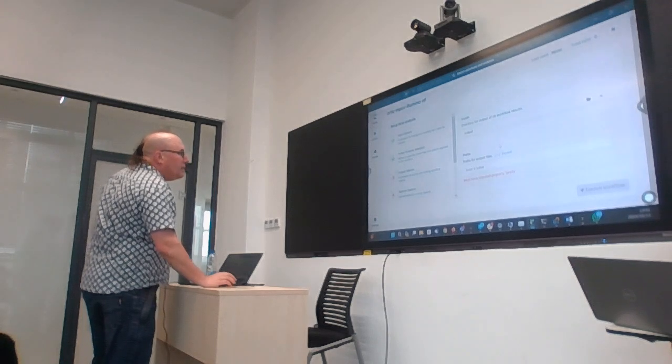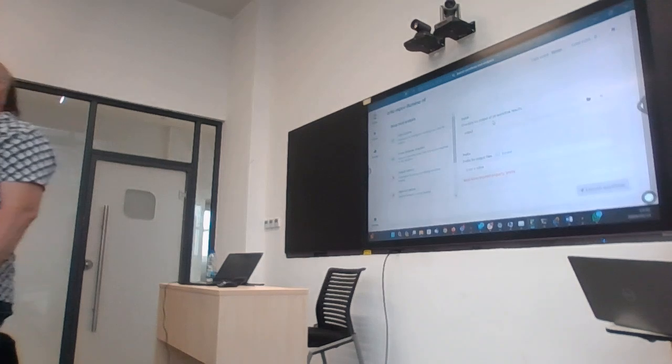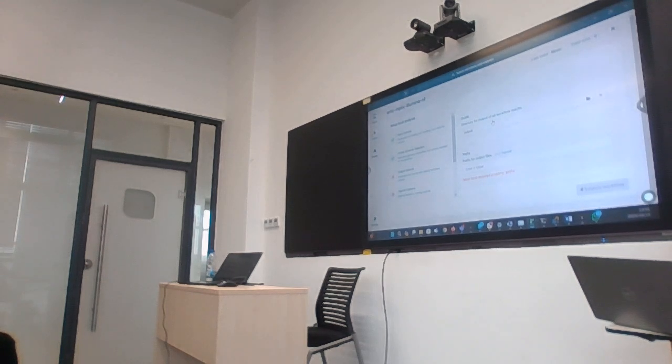Then the next one is, where do you put your results? Okay. Now, if you do not select the output location, it will put the output somewhere inside of the Epi2Me labs directory, and it will be quite difficult for you to find afterwards, because it's in some funny long name of where it is. Okay, so I always choose an output location.